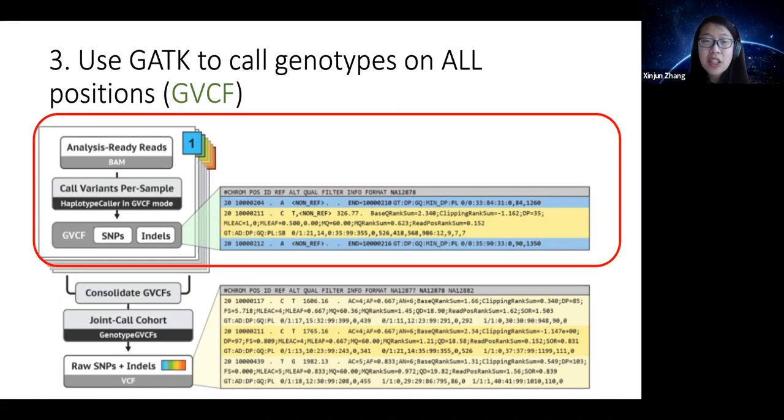If you still remember from yesterday, the GVCF file is technically a VCF, but it includes not just the variants but also the non-variants. So it's going to show you the genotype for every single location in your BAM file. The GVCF will still be relatively large. It will be smaller than the BAM file for sure, but quite a bit larger than the actual VCF file that we will get. So we're going to run something to get a GVCF per individual. Remember that at this first step, for the GVCF, we still get one per sample instead of one per cohort.